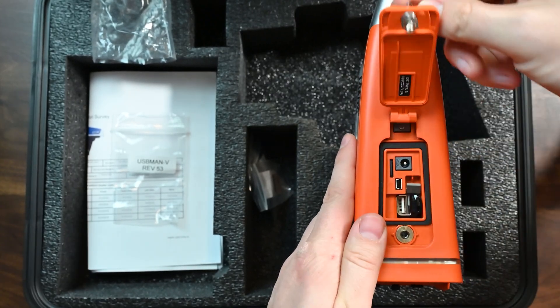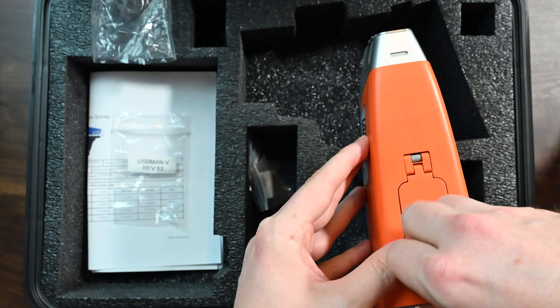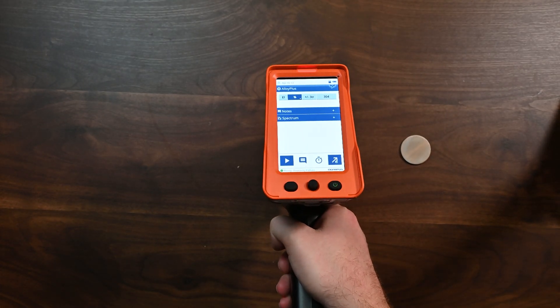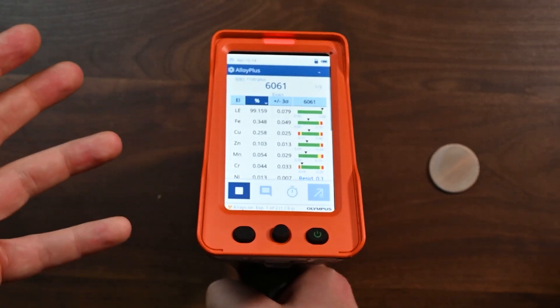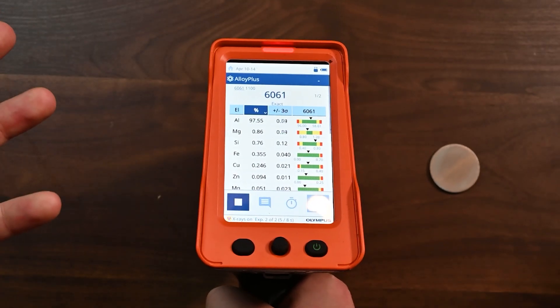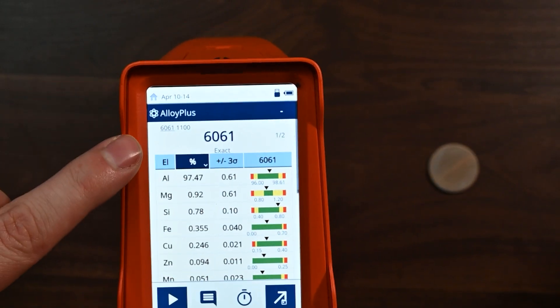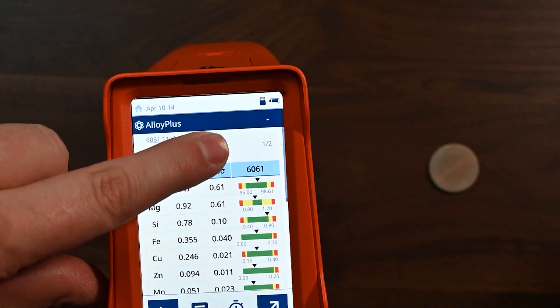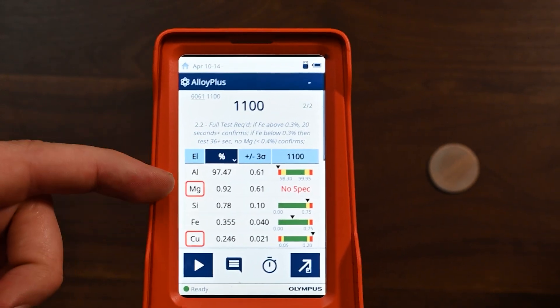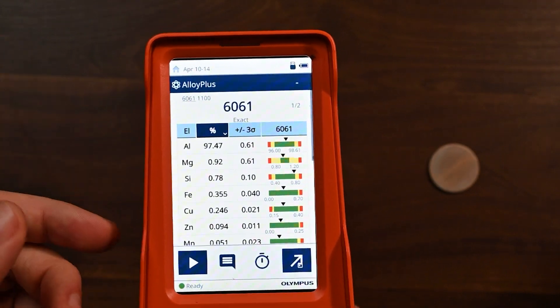With the instrument all powered up, let's take a look at some first readings right out of the box. First up we have the 6061 sample in the middle. I pressed the trigger one time. Keep in mind the test times — I've set them up for what I feel is the best test. We're doing both the heavy and the light beam. We've got 6061 aluminum with an exact match. If I want to compare that to a secondary alloy, I just touched 6061 — it shows me how it compares to 1100. You can see that some grades are highlighted, telling you which elements are out of spec for that alloy. That's great to see — not something all analyzers highlight very well. This analyzer does a great job of doing that.